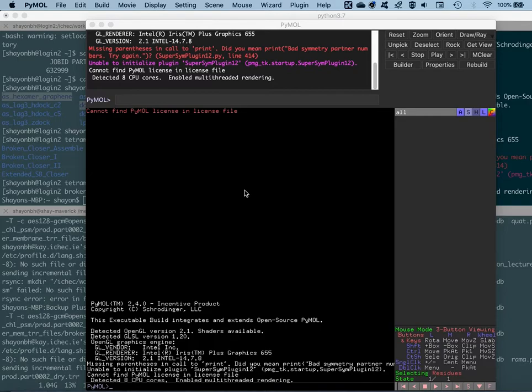Once you resolve an X-ray crystal structure, these plots help you assess the quality of your model, such that any outlier from the allowed regions will require further scrutiny, unless these regions are occupied by residues of glycine or proline.